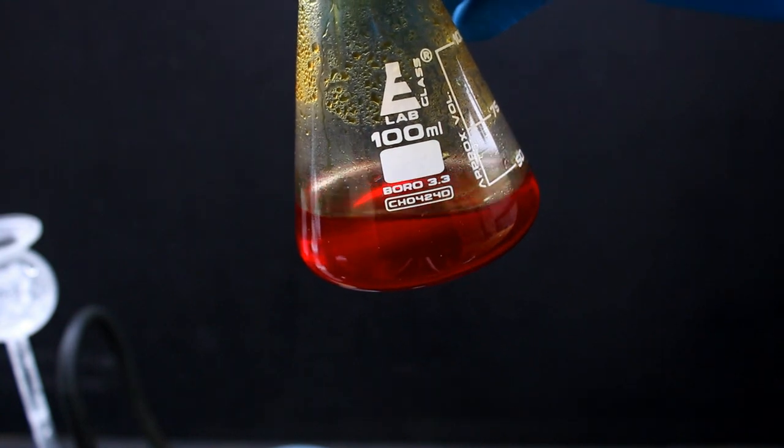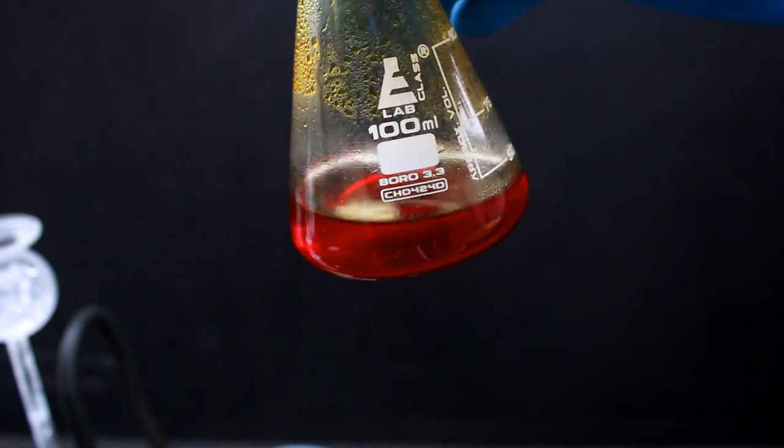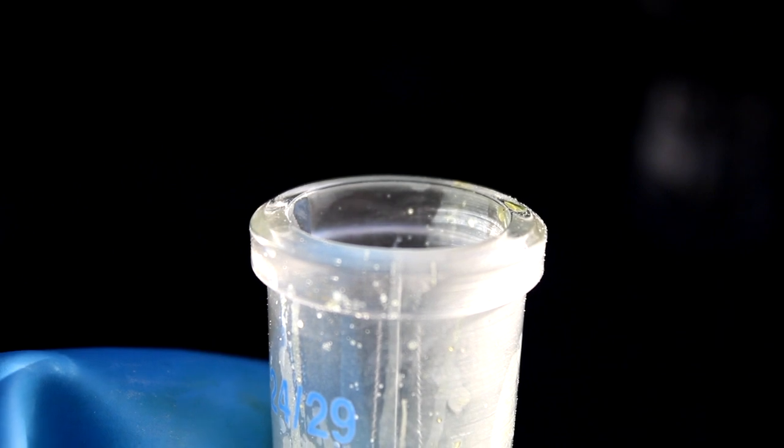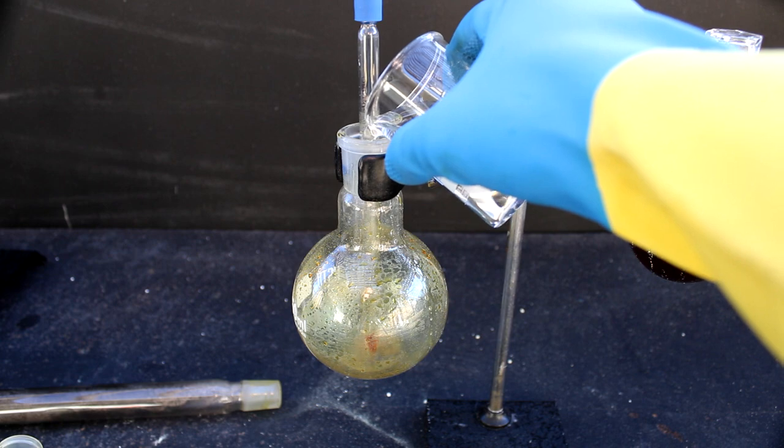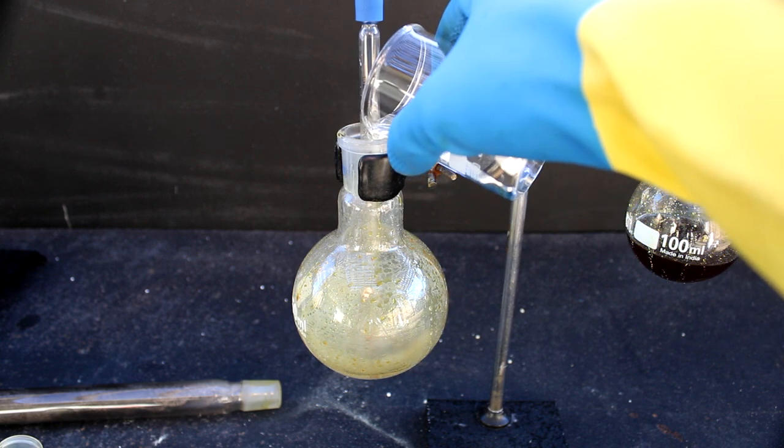Let me preface by saying that the smell produced by this chemical is one of the worst I've ever experienced. The best way I can describe it is candied farts mixed with burning rubber and hydrochloric acid. It also has a whole host of other nasty properties, which you'll get a chance to see soon enough.